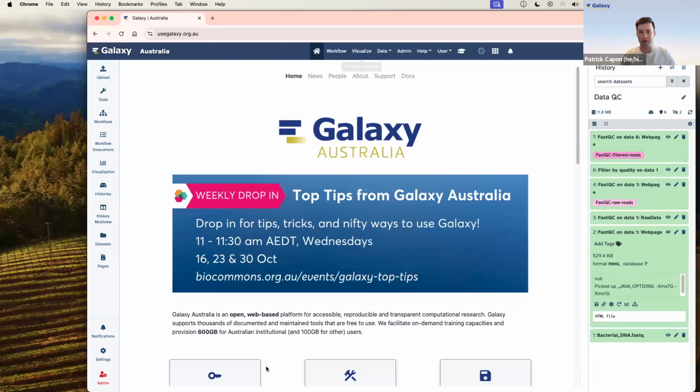Fantastic. Thanks for that awesome overview, Anna. And some really great ways to use workflows to get your data analysis done in Galaxy. So we have some questions for you.